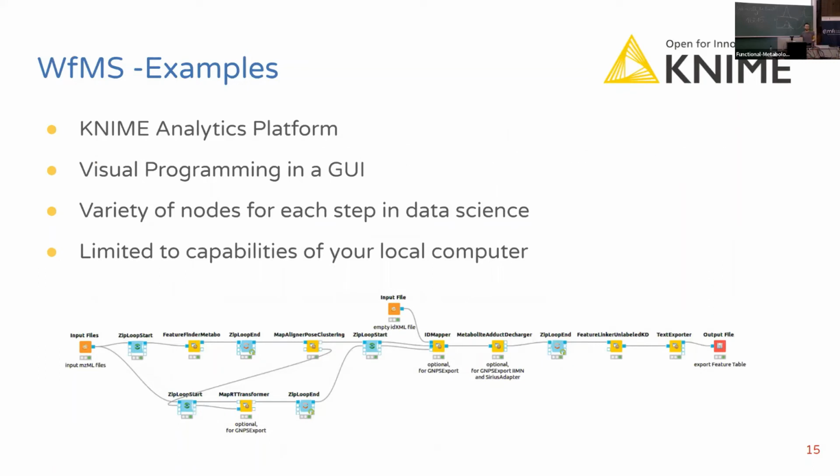So now we will give 3 examples of workflow managers that you might want to consider, and they are all very different. The first one is KNIME, the analytics platform. And this is done in a kind of visual programming way with a graphical user interface. As you can see here, we have these nodes, and these nodes have input and output ports, and they are interconnected with each other. So they share common file types.